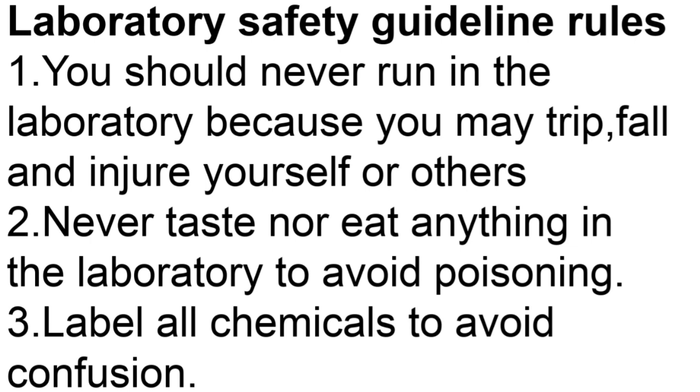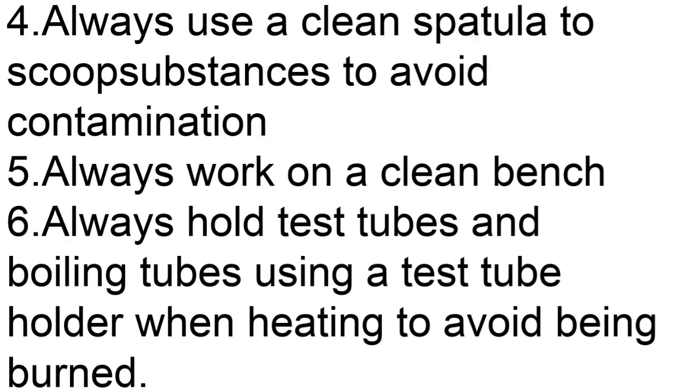Then we have said that we have some laboratory safety guideline rules, and we shall look at some of them. For example, you should never run in the laboratory because you may trip, fall, and injure yourself or others. Never taste or eat anything in the laboratory to avoid poisoning. Label all chemicals to avoid confusion. Always use a clean spatula to scoop substances to avoid contamination.